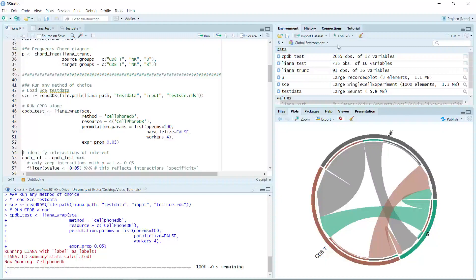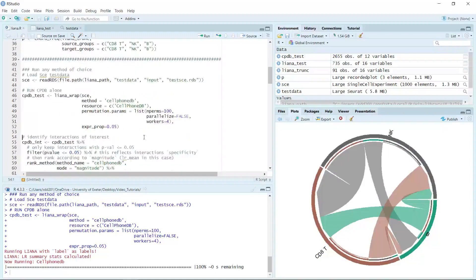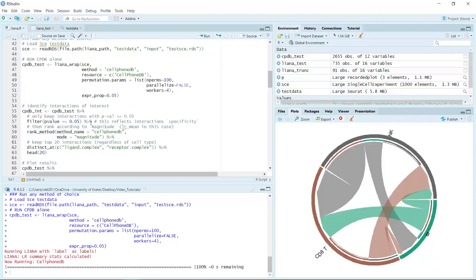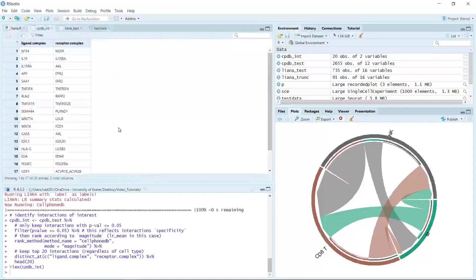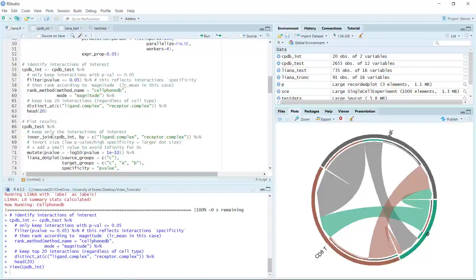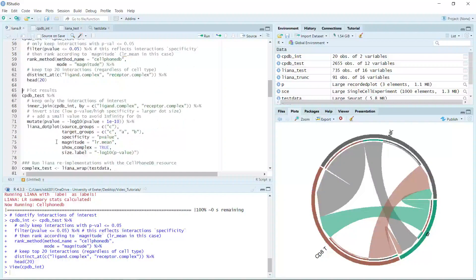We can still use the liana_wrap function. You can just set the method you like in the method part and also the resource part. I copied the code from the online tutorial — we use 100 for the permutation parameter. Let's run. Now you can see we only ran the CellPhoneDB method and will get the result from the CellPhoneDB analysis. You can see now we have 2655 rows with 12 columns. But not all the results are significant, so we can filter the data — just keep the p-value smaller than 0.05 and only keep the top 20 interactions.